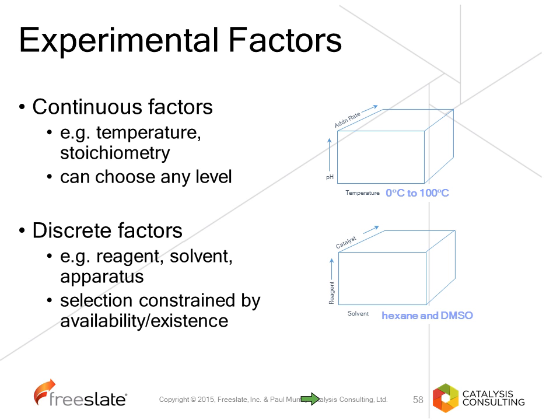And an example of discrete factors in solvent is what's the difference between hexane and DMSO? And if you had to run a reaction, which solvent would you choose? Well, this can be very tricky. From my experience, a reaction such as a Heck reaction can be significantly affected by the solvent. And electron-rich Heck reactions normally work better in polar aprotic solvents.